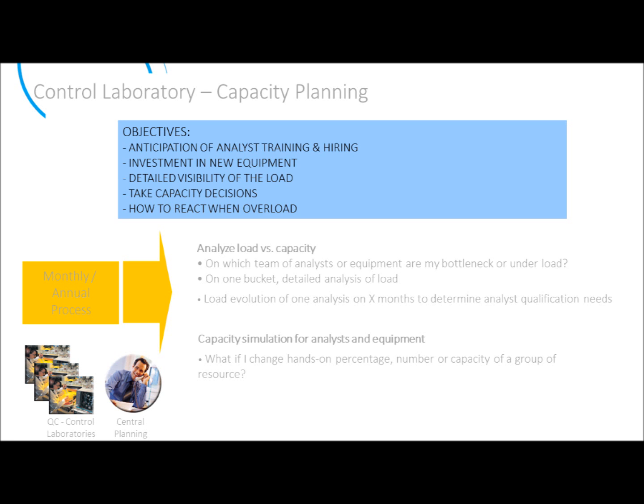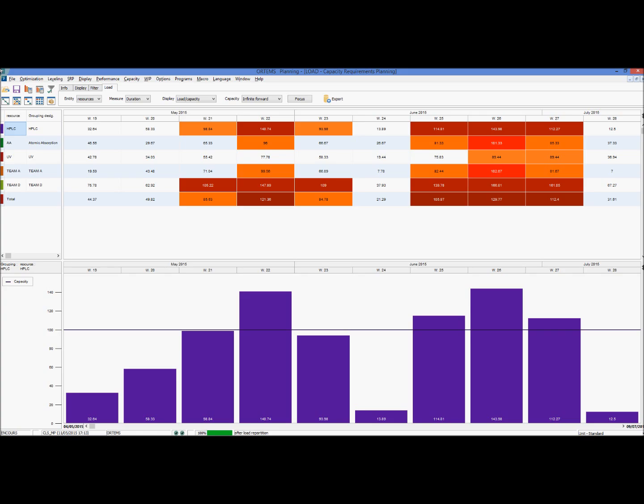So we will first in this demo analyze the load versus the capacity, and then we will go into the simulation in order to release some load for the analysts and the equipment. Let's come back to Ortems.